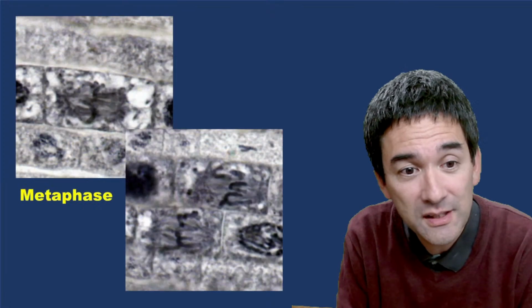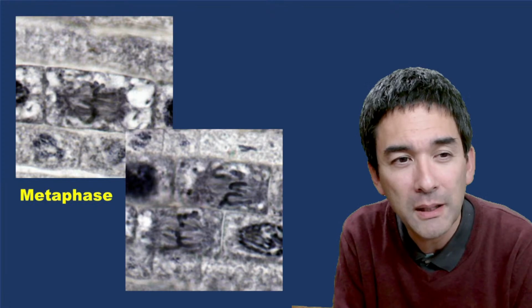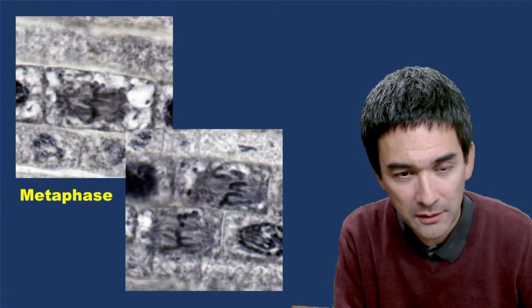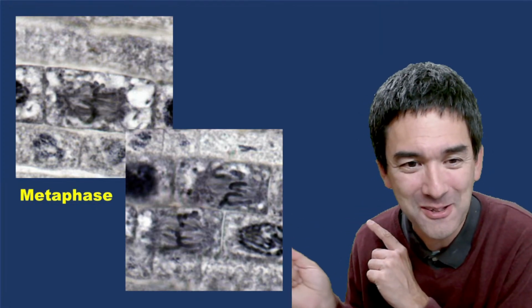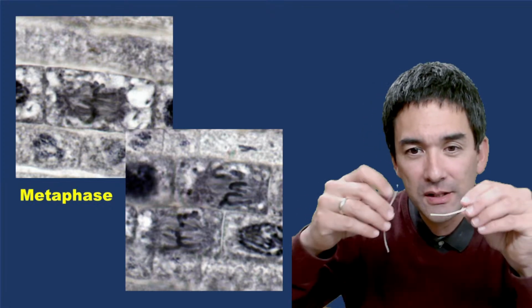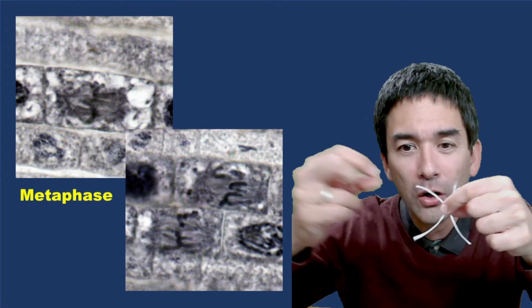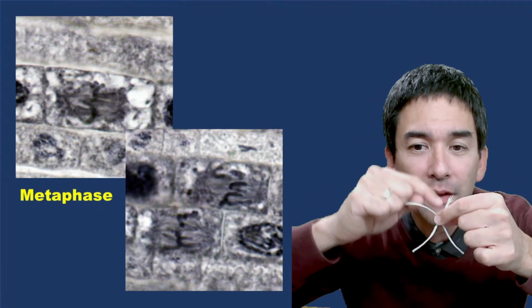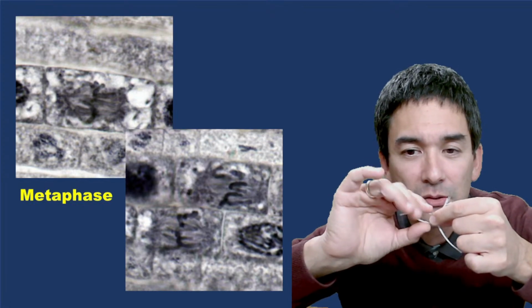And the next one here is what I kind of showed you, and this is a little bit difficult to see, but maybe you want to look at the bottom picture on the right side. Unfortunately I cannot point to it, because you see my hand disappears, right? But this is what I tried to make clear: when the chromosomes align in the middle of the cell, the arms of the chromosomes are pointing outwards. Okay, and there are many of them lined up. And these are typical metaphase.